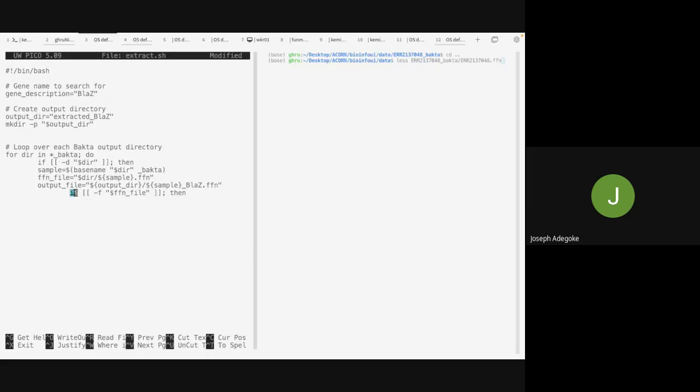I was even thinking it's going to be just a tab difference. It shouldn't be this big. I hate Nano. Yeah, me too. I wouldn't use Nano for it, by the way, but we can continue.